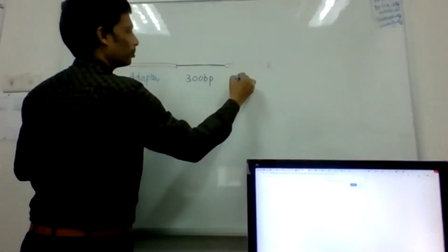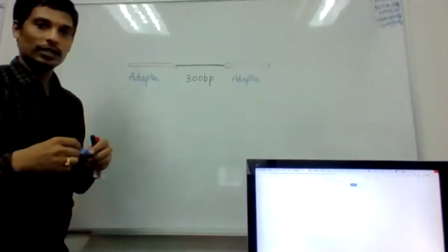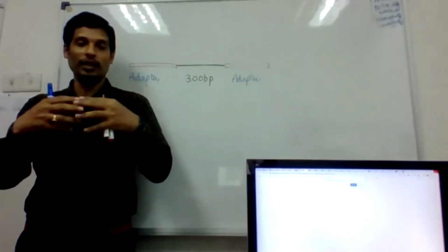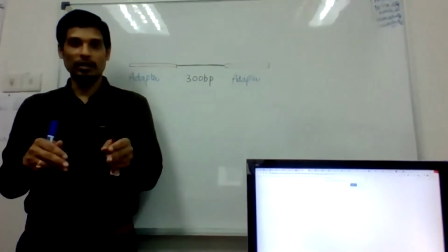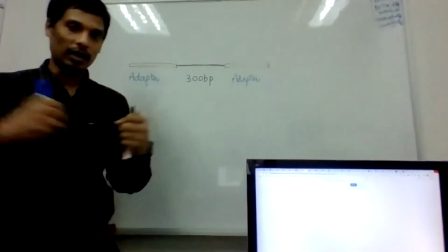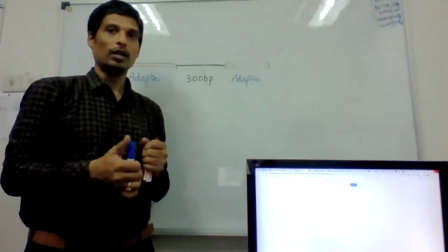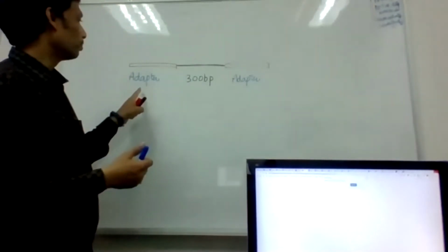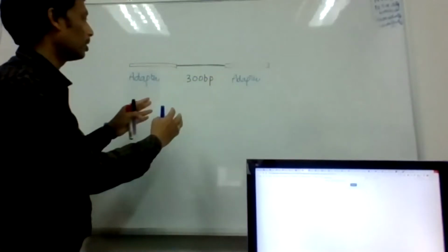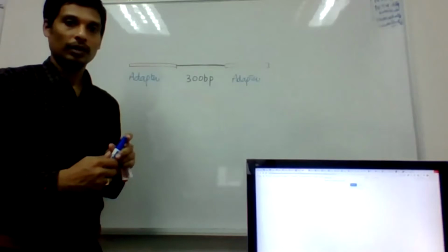In genetic engineering, you have understood a little bit about how to do the ligation of the DNA and how to lyse, isn't it? Some of the enzymes can break, some of the enzymes can attach. So using those different kinds of enzymes, we are breaking the sequence to around 300 base pairs and adding the adapters at the 5' and the 3'.